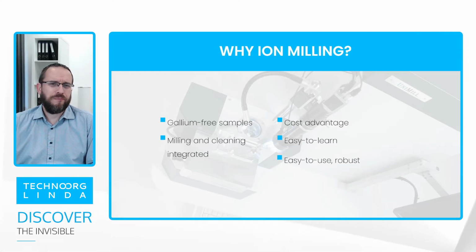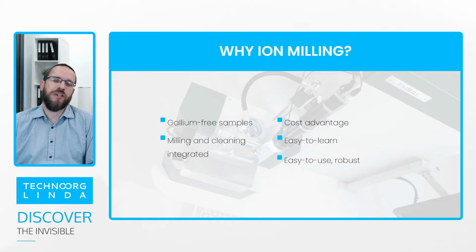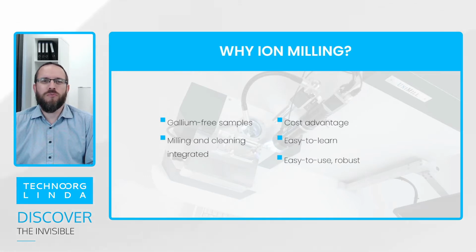Now, what are the advantages of argon ion milling? So, in my view, one main advantage is that we get gallium-free samples. So we don't have chemical reactions or visible contamination of gallium in the sample. The cost advantage is quite an obvious one, and it's quite a big advantage.